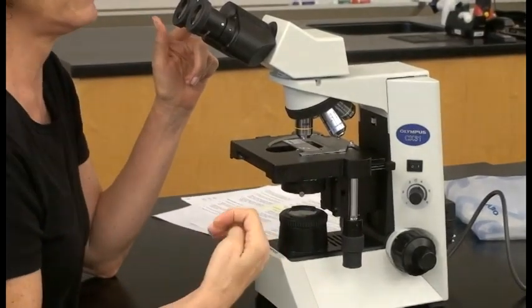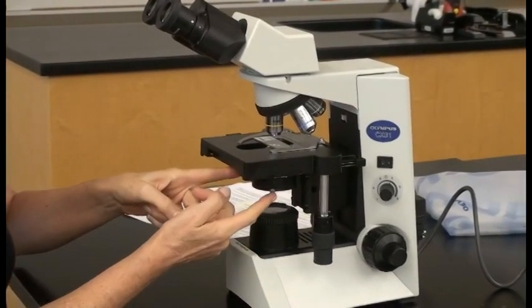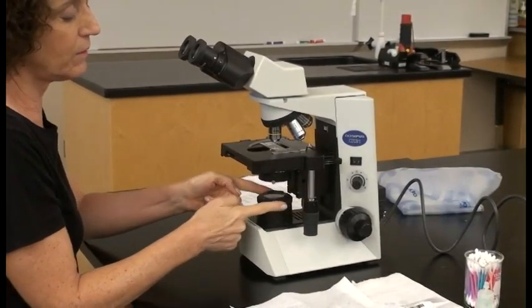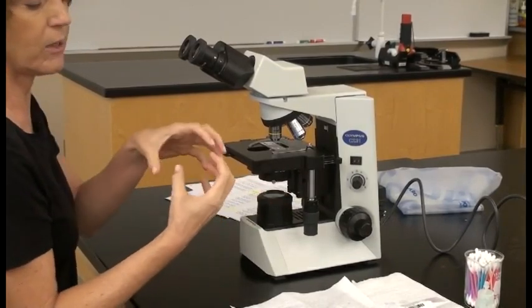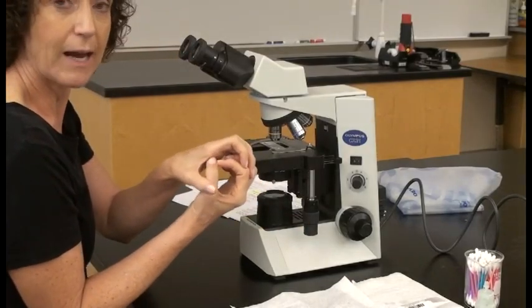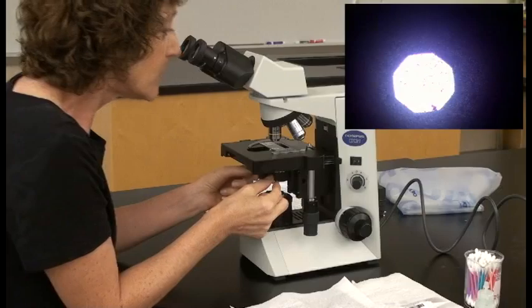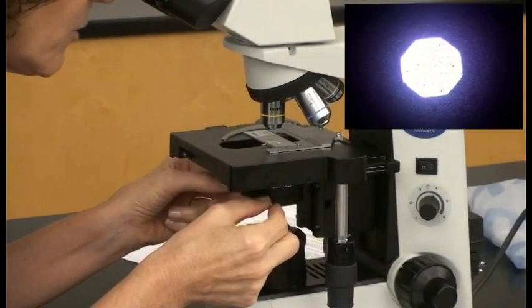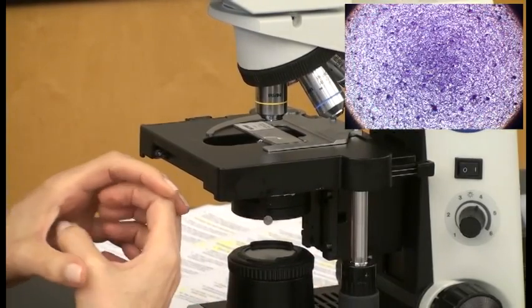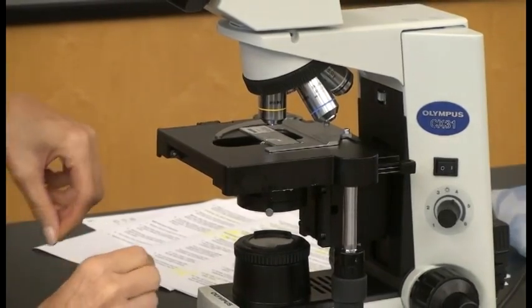Now we have magnification set up, and the next thing is to make sure our light is set up properly. We need to make sure the condenser is centered in the middle of our field. To check this, decrease the amount of light coming through the field diaphragm. You should see one circle of light centered with the rest dark. If it's not centered, use the centering screws to maneuver the condenser. Once centered, open up the field diaphragm until the light increases just outside your field of view.